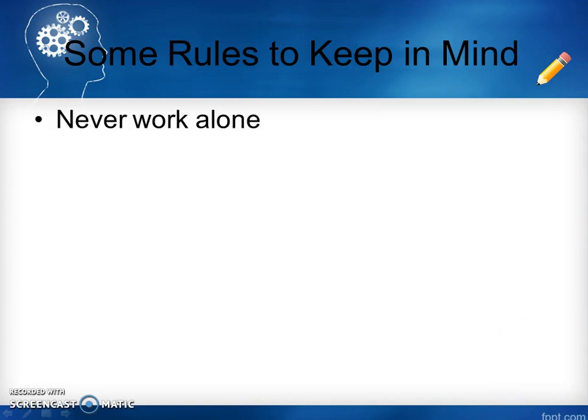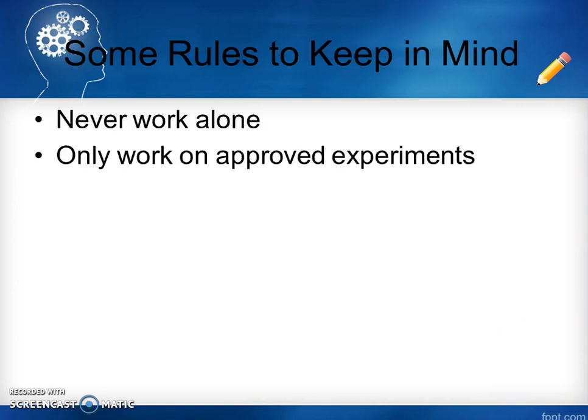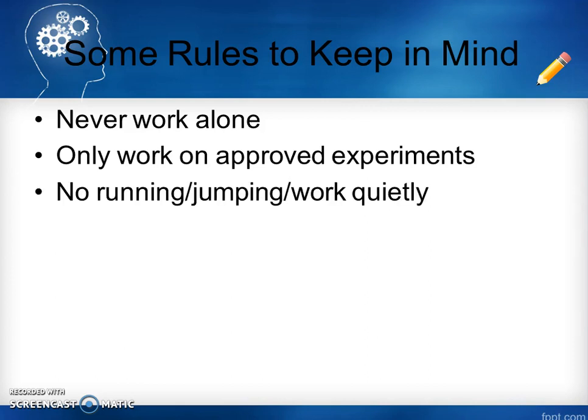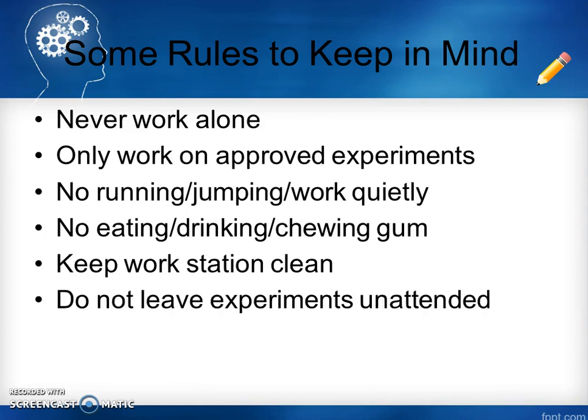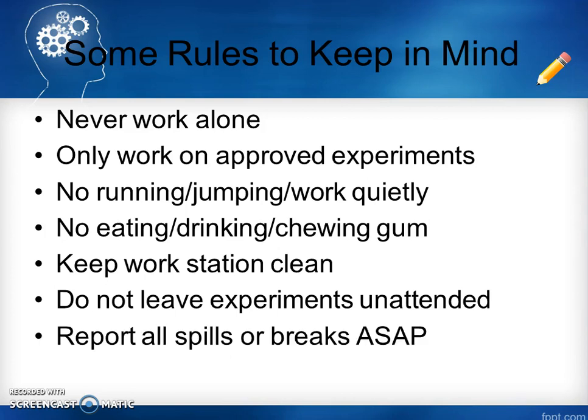Okay, some rules to keep in mind. Never work alone. Only work on approved experiments. No running, jumping. You got to work quietly. No eating, drinking, or chewing anything in a lab. Keep your workstation clean. Less chance of contamination. Don't leave experiments unattended. Report all spills or breaks. And above all, use your common sense. So if something doesn't seem safe, go with that gut feeling.